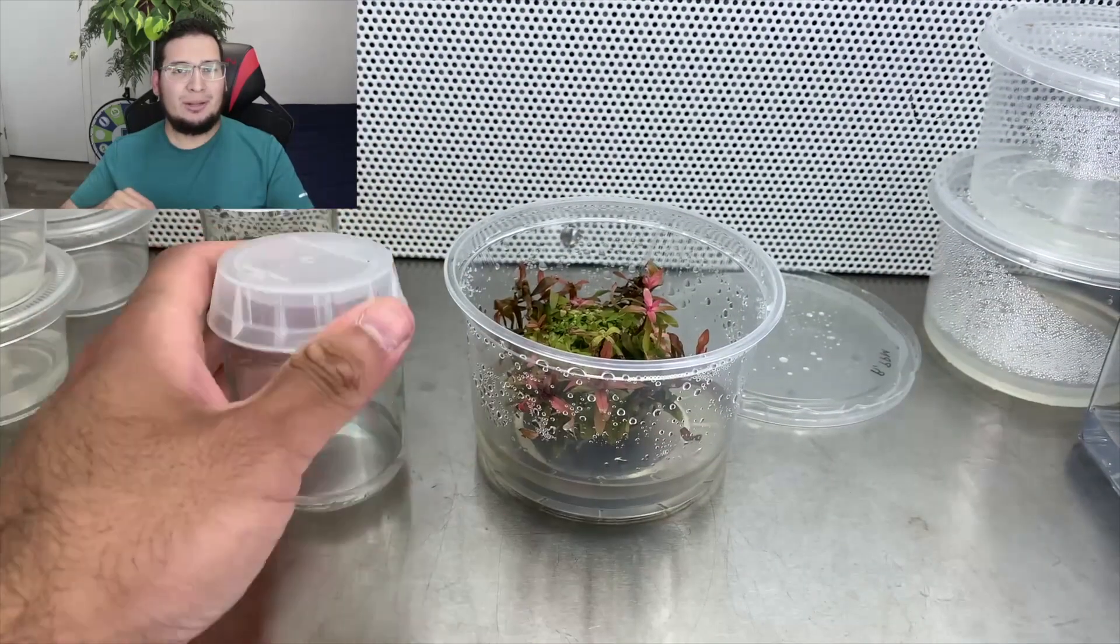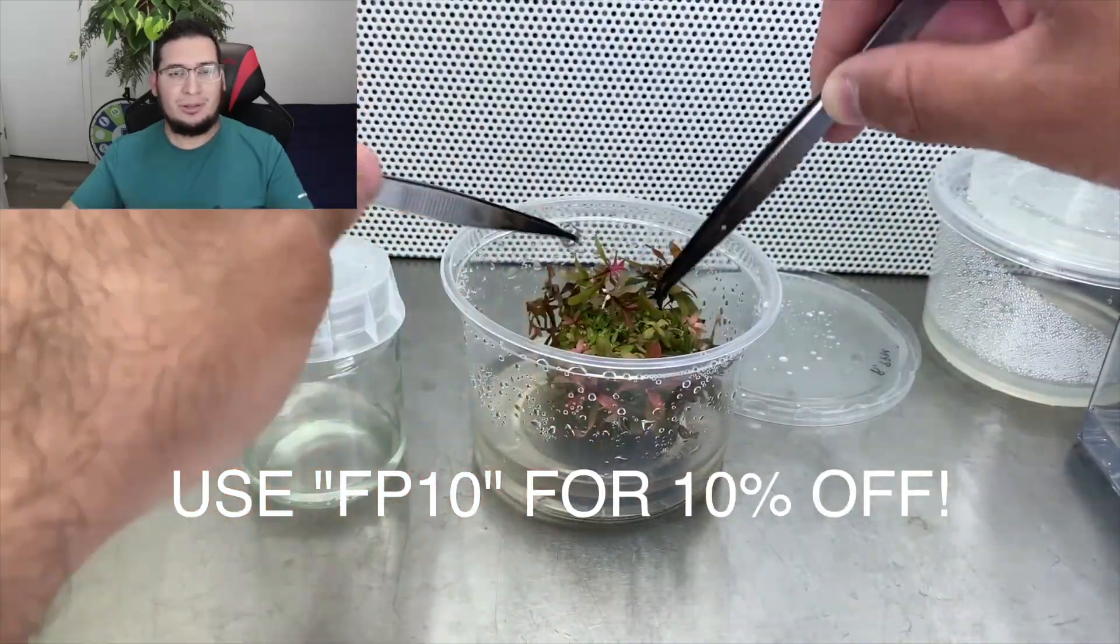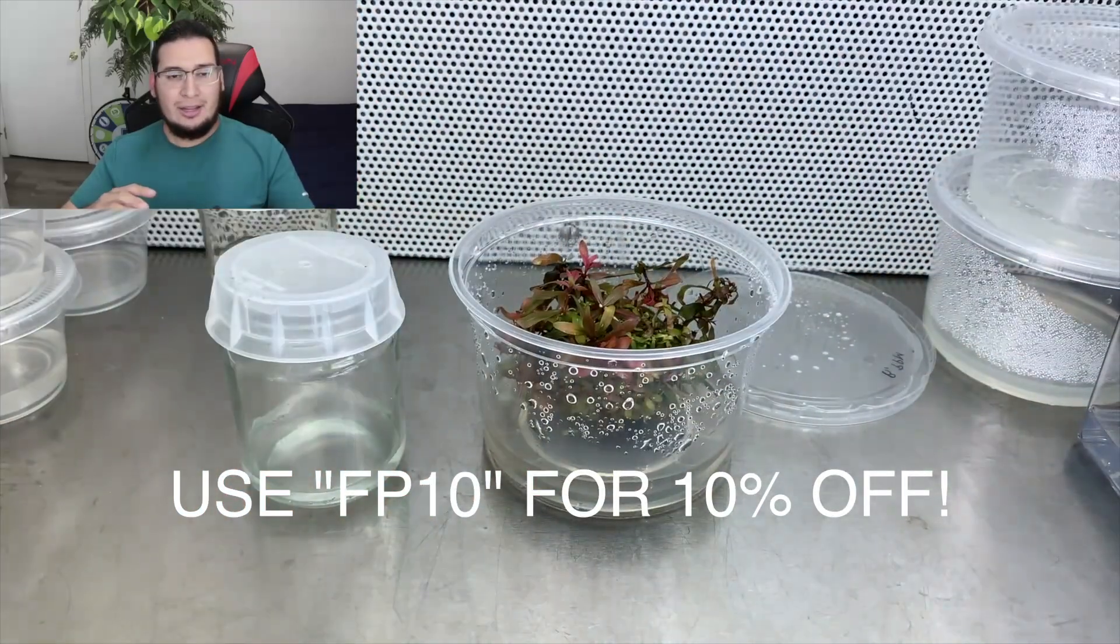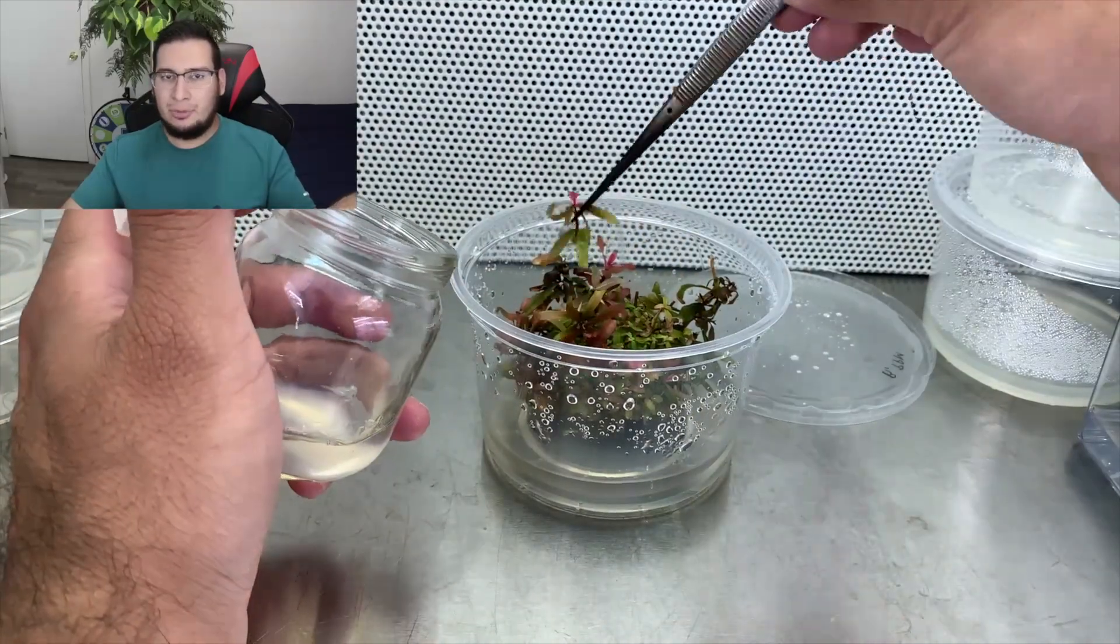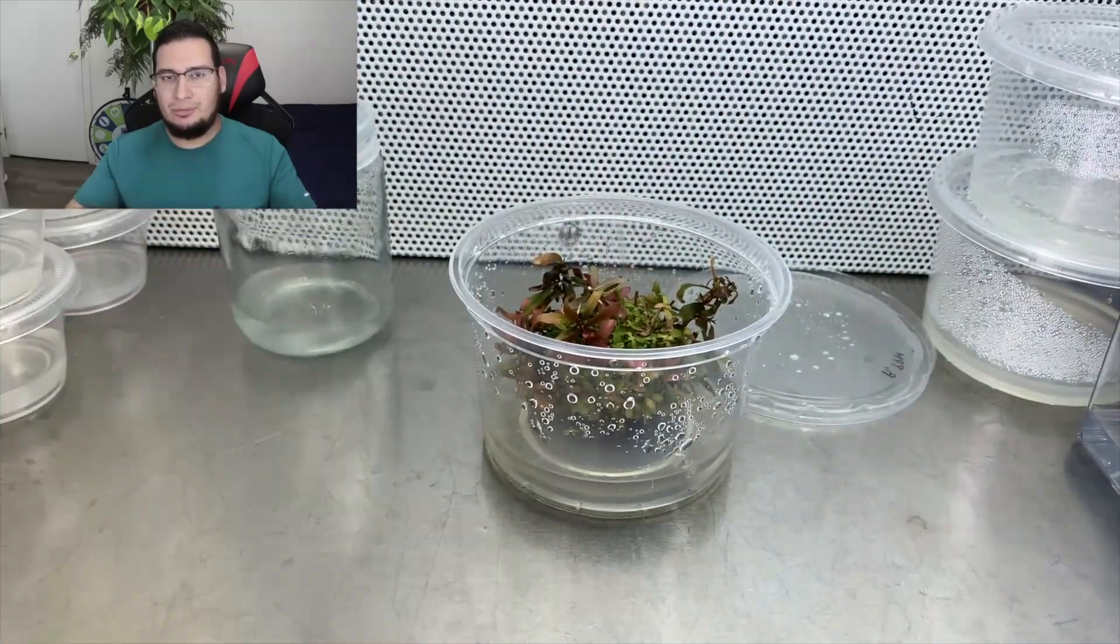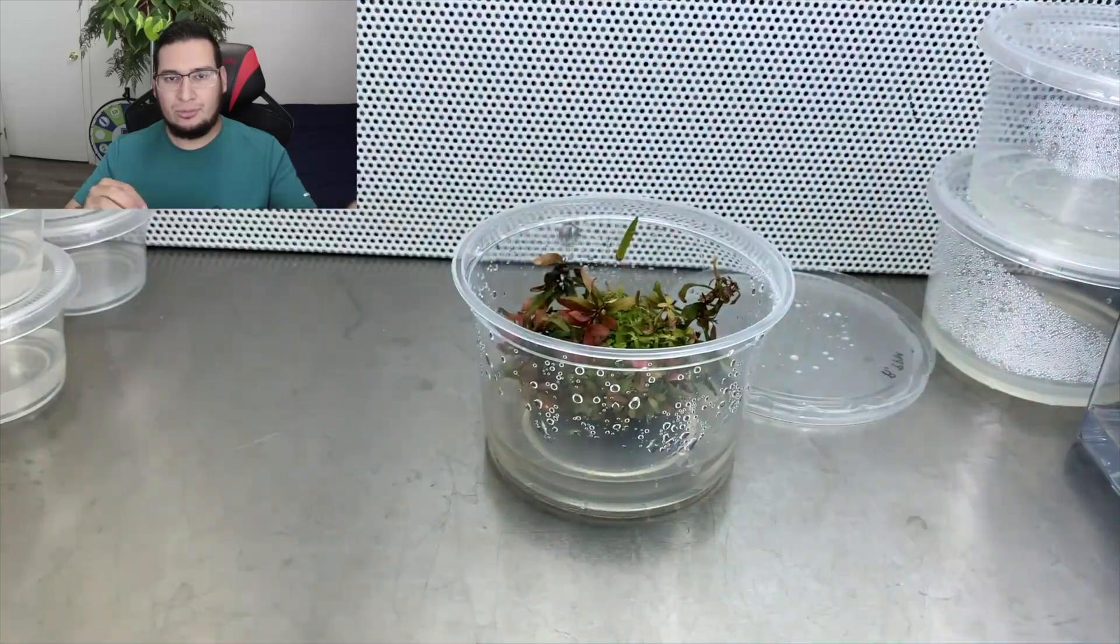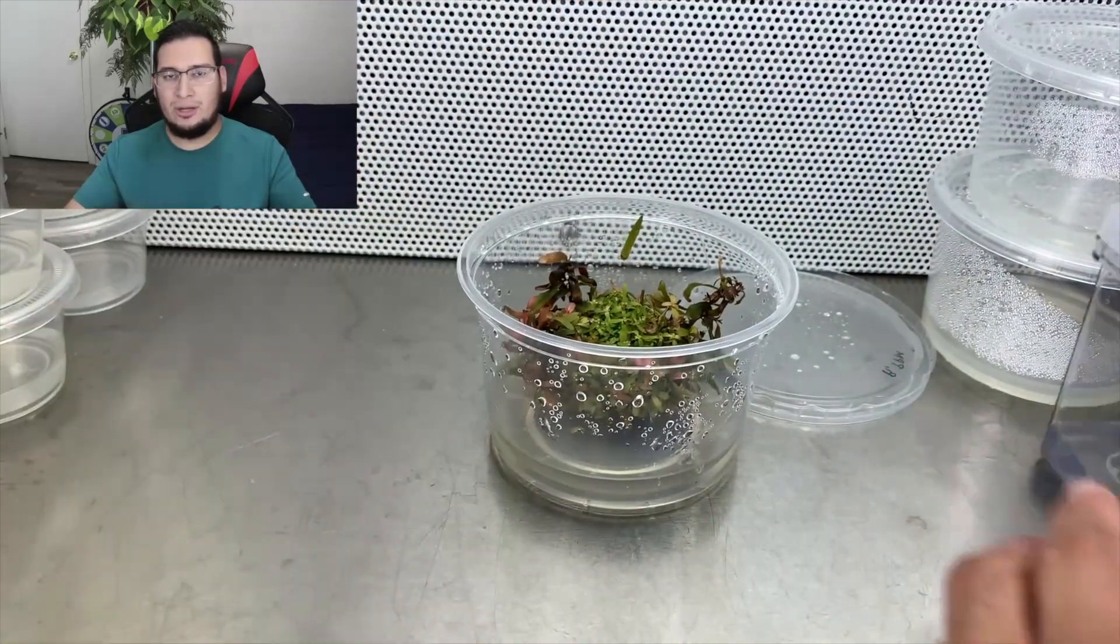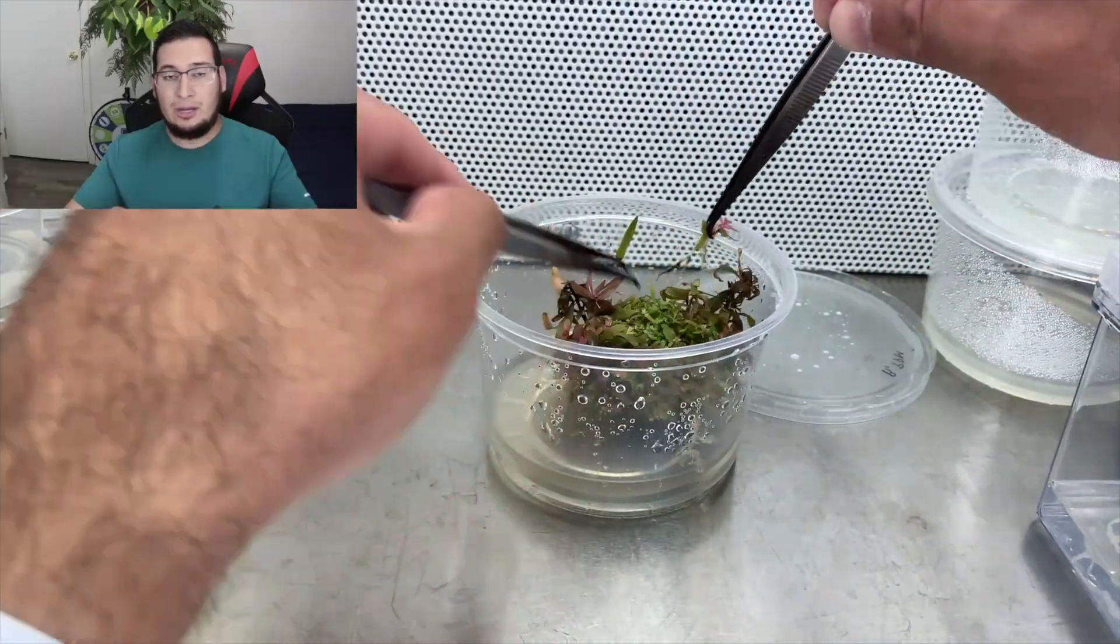What is going on guys, welcome back to another video on the temporary immersion bioreactors. This time I'm working with Ammania gracilis. For this video I'm not going to show you the entire process. Basically you've seen the previous video, you already know what is happening. I'm just moving the plant to different types of containers and trying to see what works best for each plant.